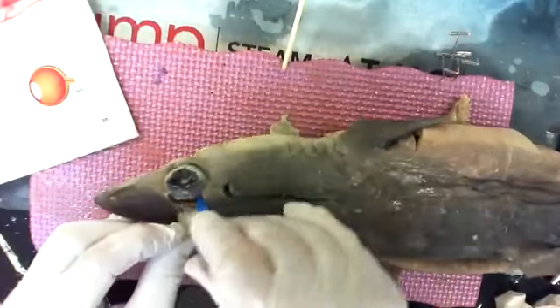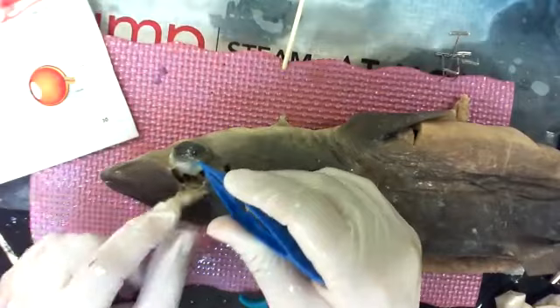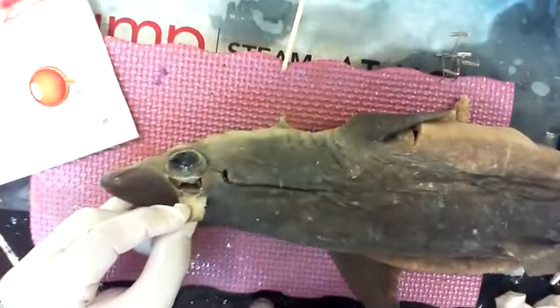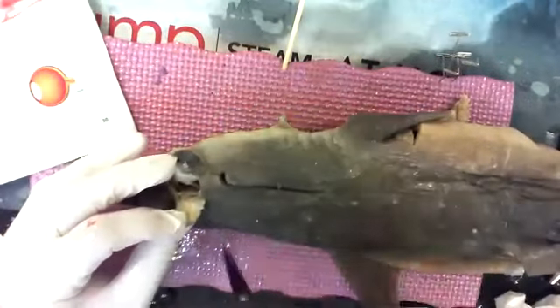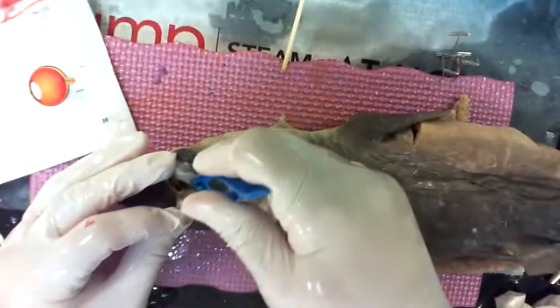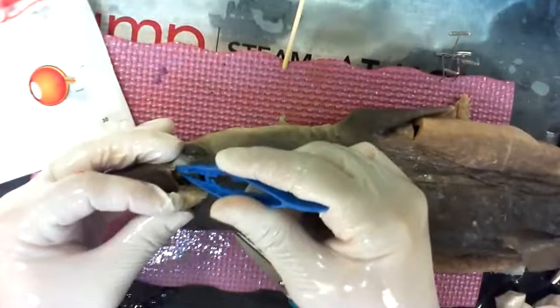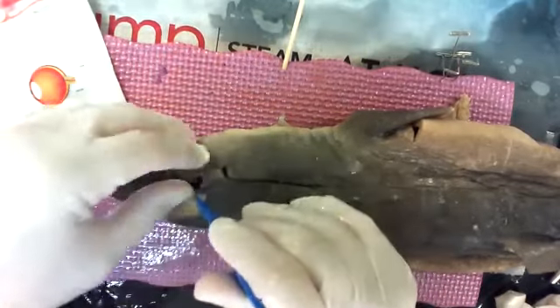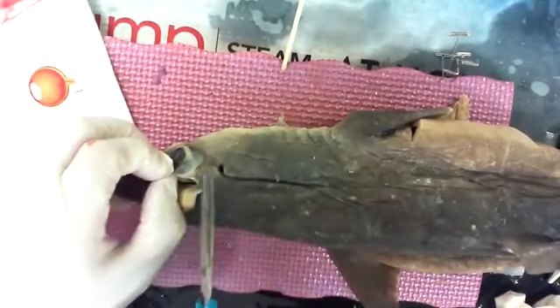If you're looking back here and it looks kind of pink in color, see the connected structures? Never fails. Your cheek or eye always itches when you're deep into dissection. Here we go. Here's a muscle here. Here's a muscle right here. You see it? You can see these individual muscles. The goal with taking the eye out is we want to try and get the eye out with as many of this structure still attached.